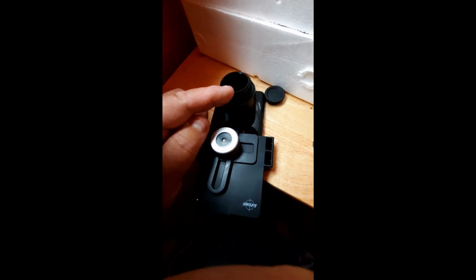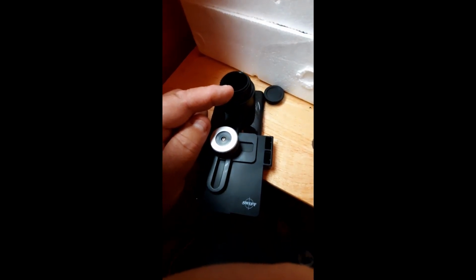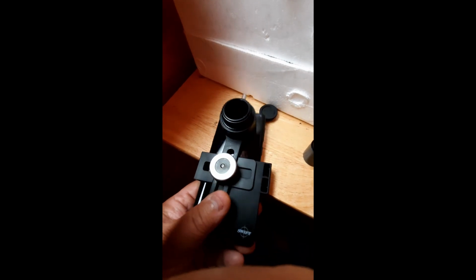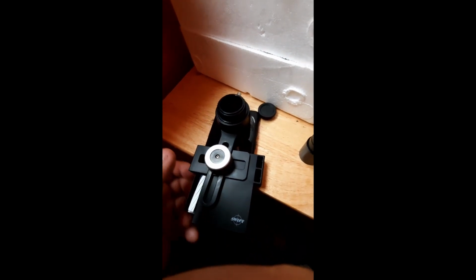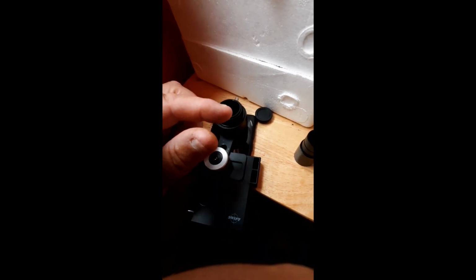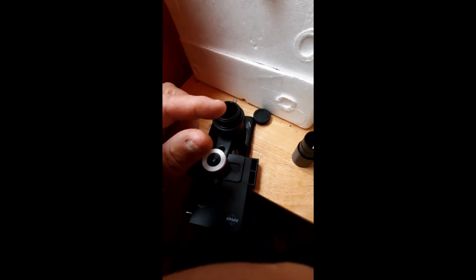Just align the viewfinder with your camera phone, which is quite simple to do because this undoes and that just swivels onto your camera, and you can see your camera through the little adapter there, so you know that it's perfectly aligned.